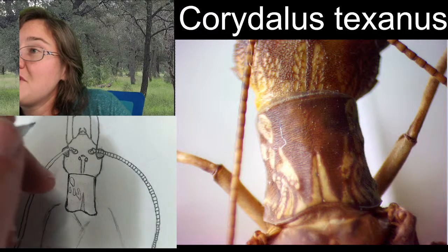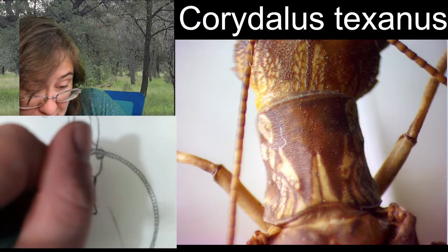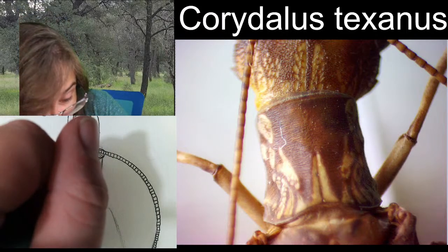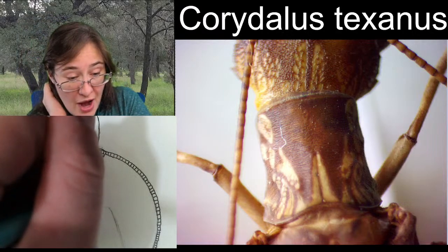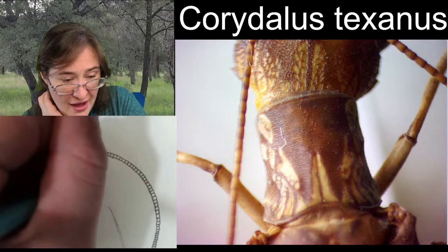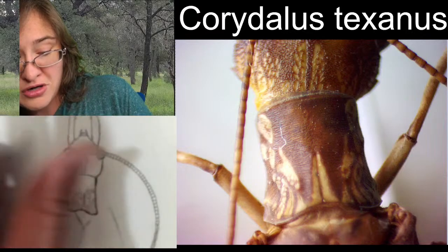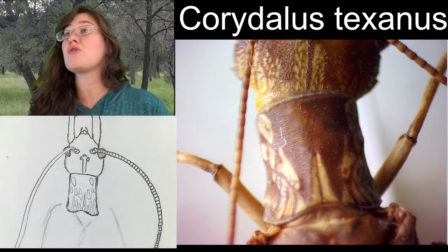And I would definitely say if these fine details are something that you're interested in sketching, do it, because the likelihood is these characteristics of this design on the pronotum will help you at least start identifying the specimen. These textures in the pronotum are generally the same throughout. They're not going to vary too horribly much.